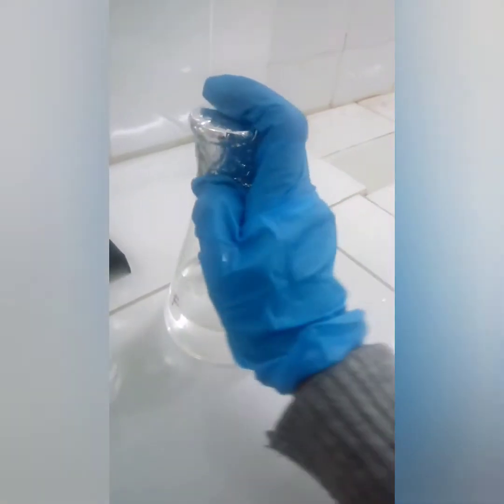So now we will measure the pH of this buffer. If it's more acidic, because we add glacial acetic acid in this buffer, so it is acidic. So if it is too acidic, we need to bring the pH to 5.